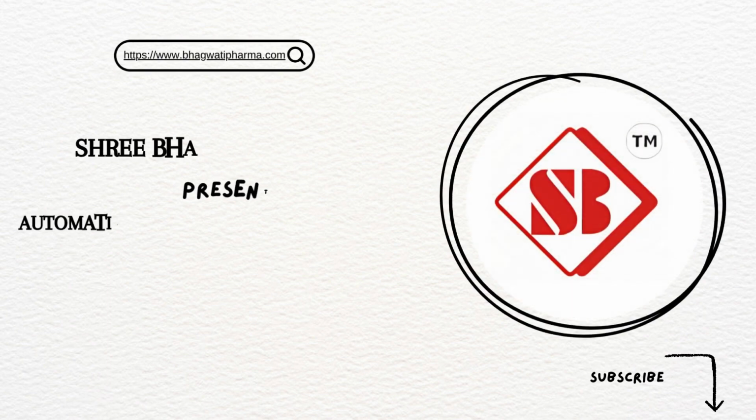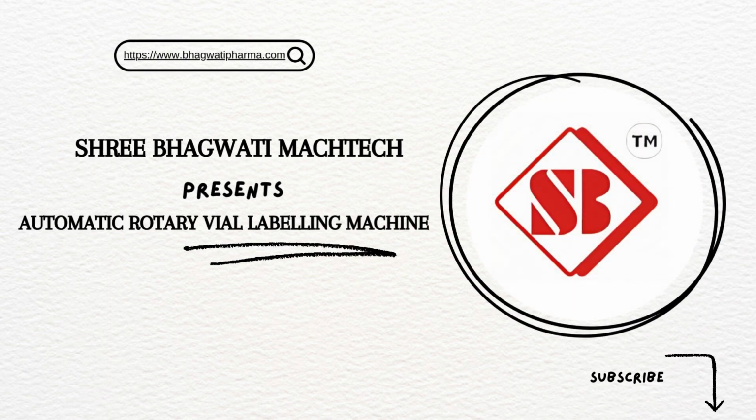Shri Bhagwati, manufacturer of customized automatic rotary vial labeling machines.